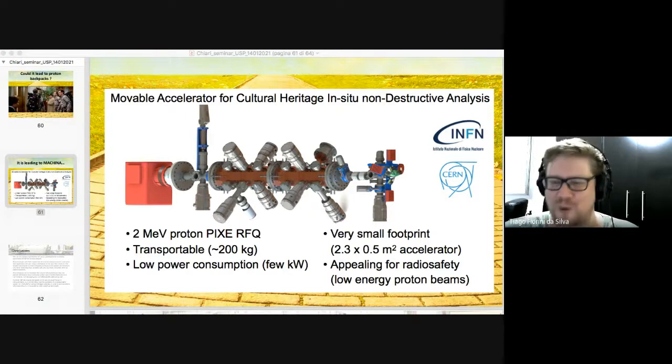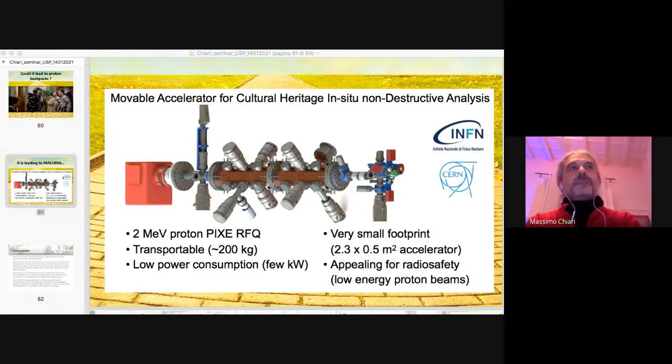It's always problematic. But for example, the application of PIXE to environmental samples like aerosol filters is perfect, because with thin samples the analysis is very straightforward. So you can indeed measure, and the day after have the quantitative analysis.